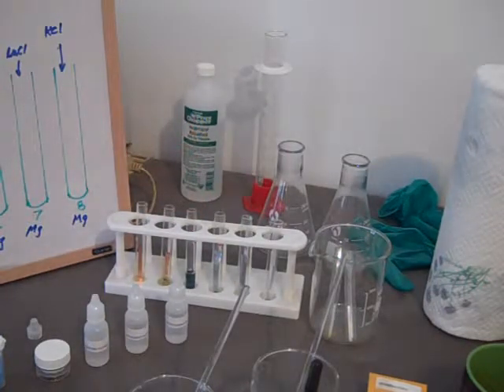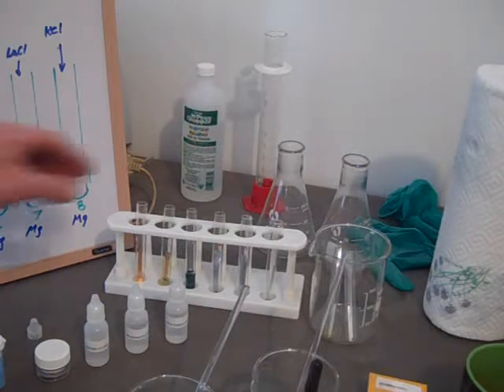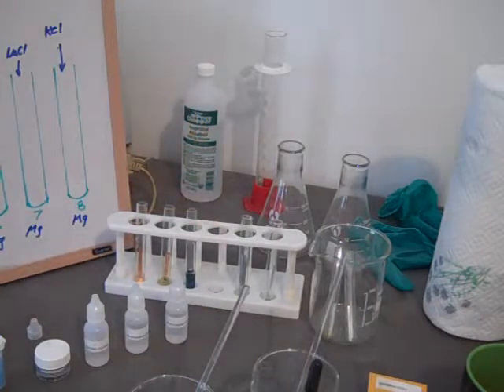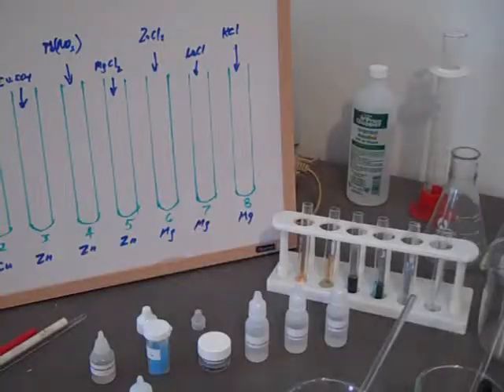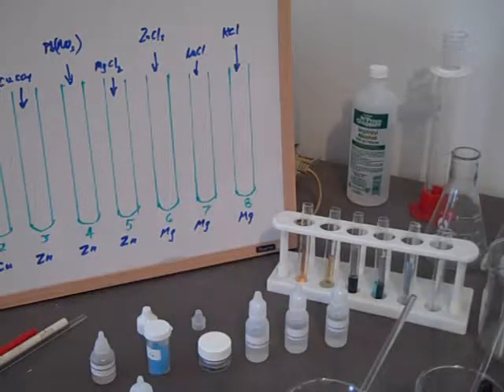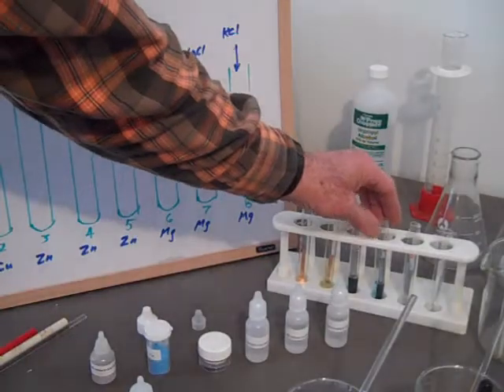The next one is lead nitrate. And lead, you see, again, is lower than zinc. So we should get, again... okay, back again.